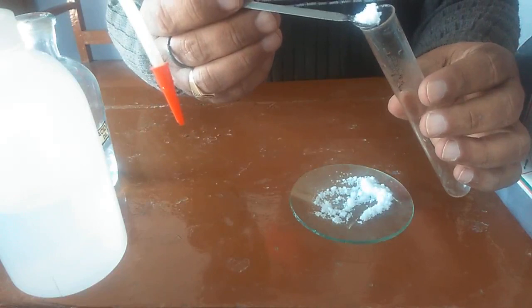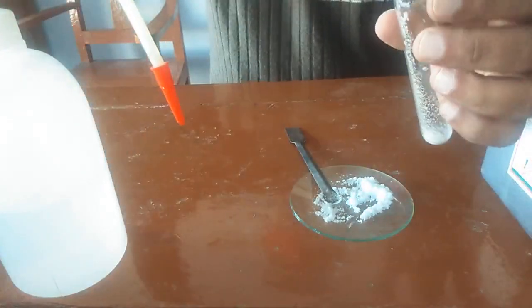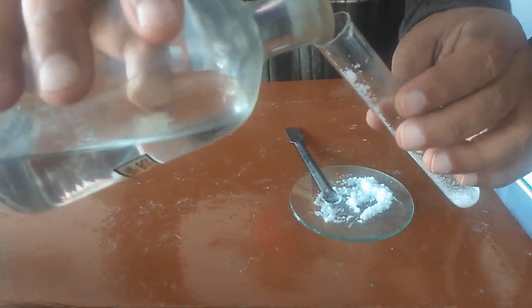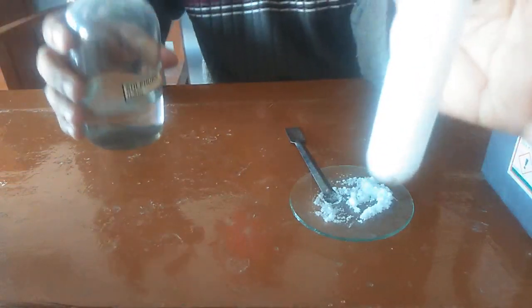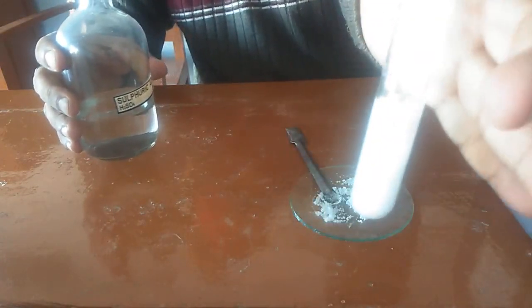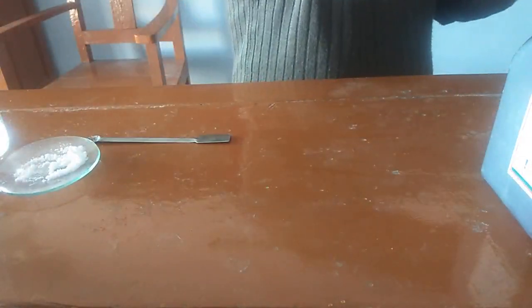We will add some salt to a test tube. Now we will add the reagent of group 1, which is dilute H2SO4. As soon as we add this reagent to the salt, brisk effervescence will evolve. This is due to the formation of carbon dioxide gas. This shows that the salt has carbonate ions in it.